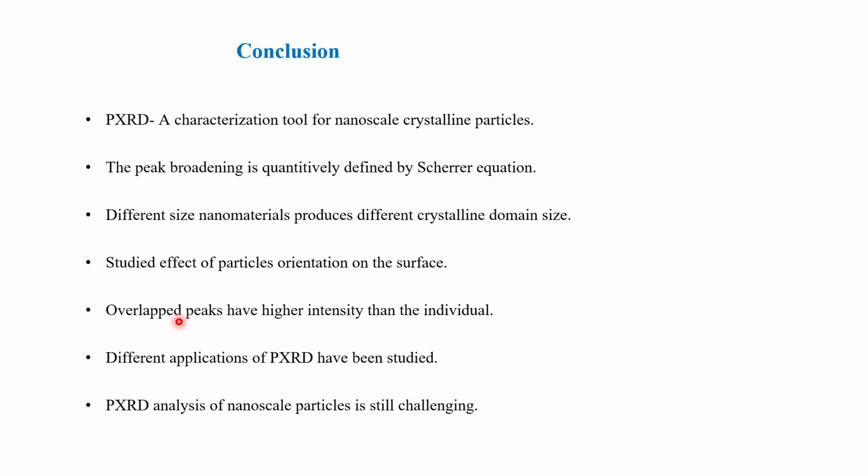In conclusion, in this slide deck we have covered what PXRD is and its characteristic tools, the peak broadening concept by the Scherrer equation, how different size nanomaterials produce different crystalline domain sizes, and we studied the effect of orientation and morphology.